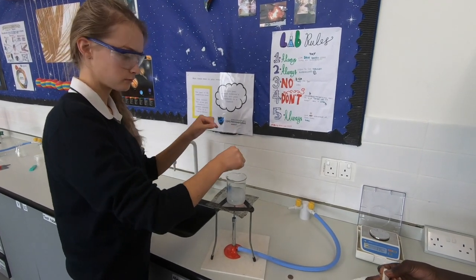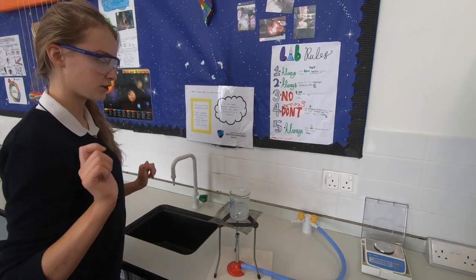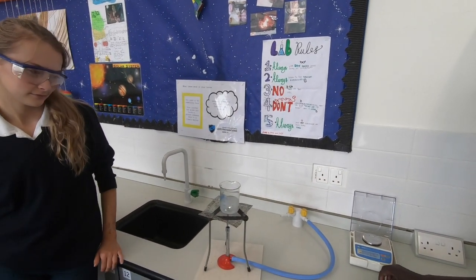All of the zinc strips go in, and we're waiting for it to dissolve. Then we'll add the copper coins.